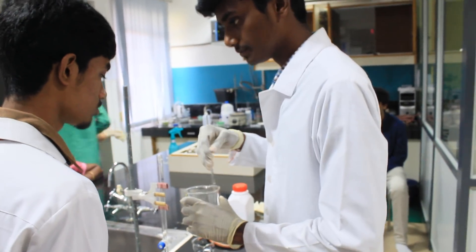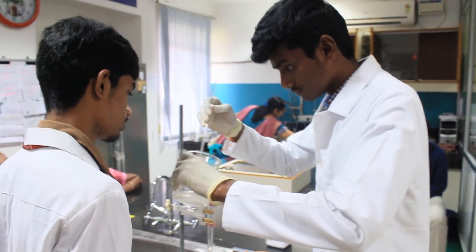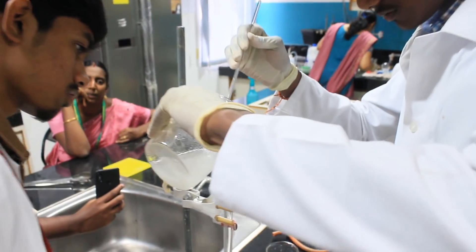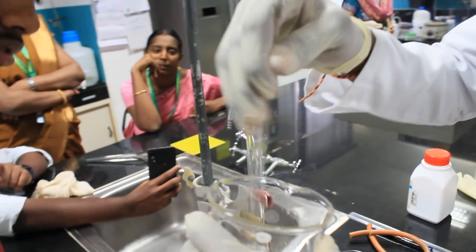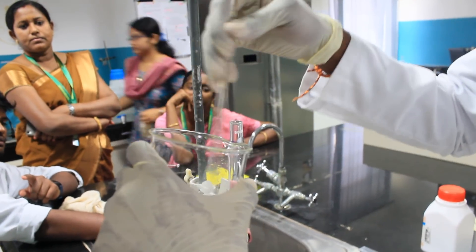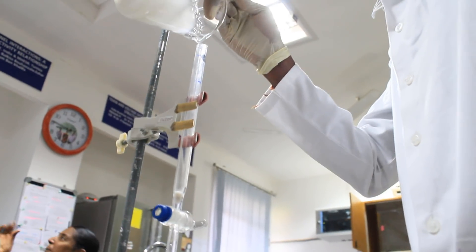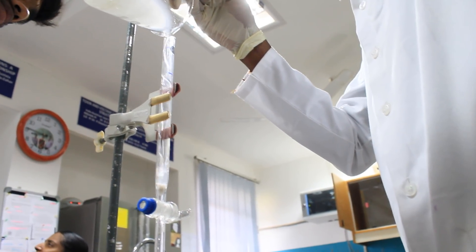The next step is the separation of the various proteins in the venom. A SAFREX column is used for this purpose. The compounds are separated on the basis of the difference in their molecular sizes. The sample is passed through a SAFREX G50 column using acetonitrile as the mobile phase. There are five different fractions obtained.